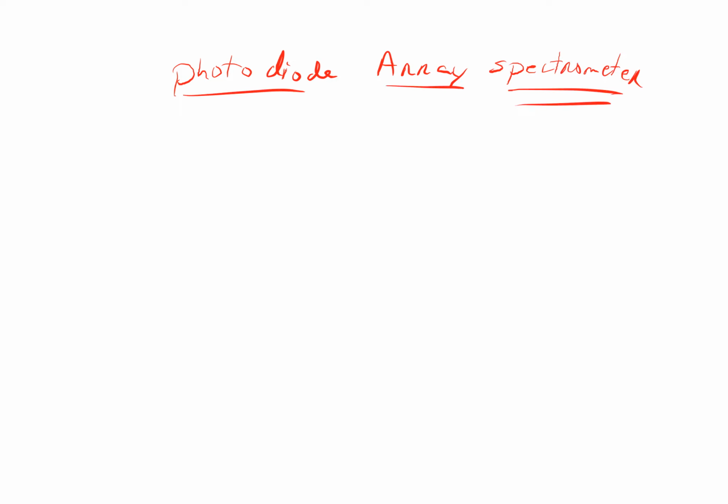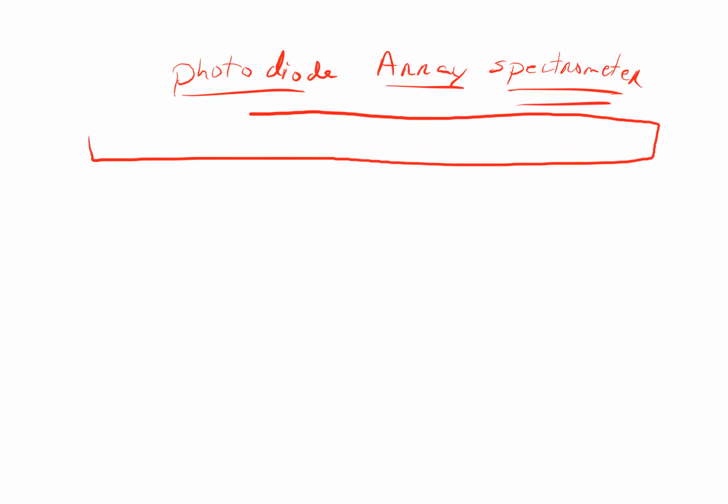Well, I'm moving into the next section I want to tell you about, okay? There's a newer type of spectrophotometer that has been developed that has pretty much taken over the field right now. And it's actually based upon photodiode arrays, as they're called. Now I mentioned one of the advantages of photodiodes, not only are they really cheap, but you can make them super small, even micrometer size, potentially.